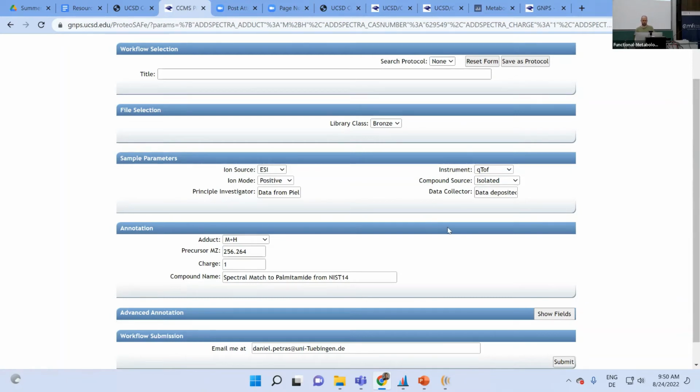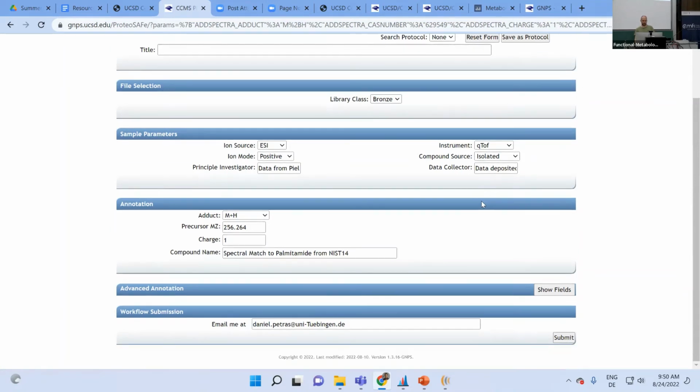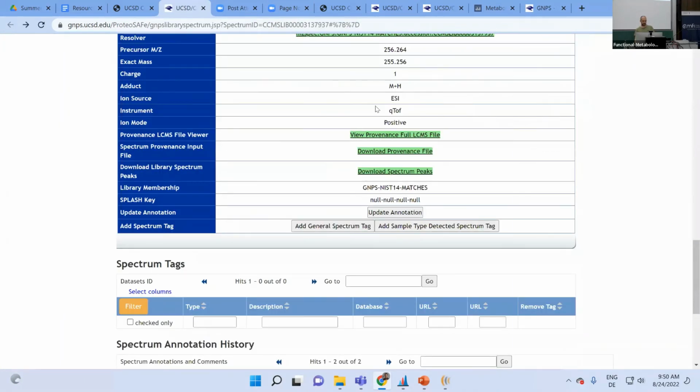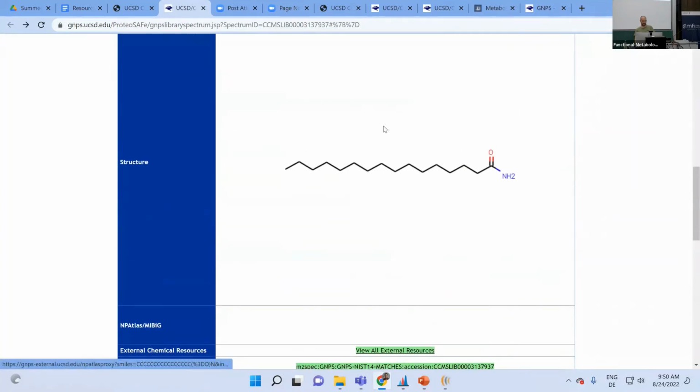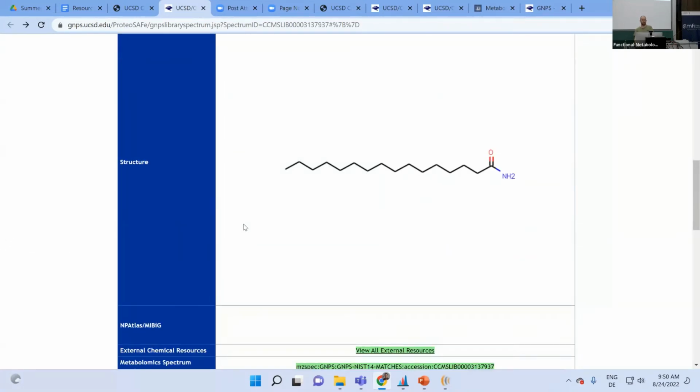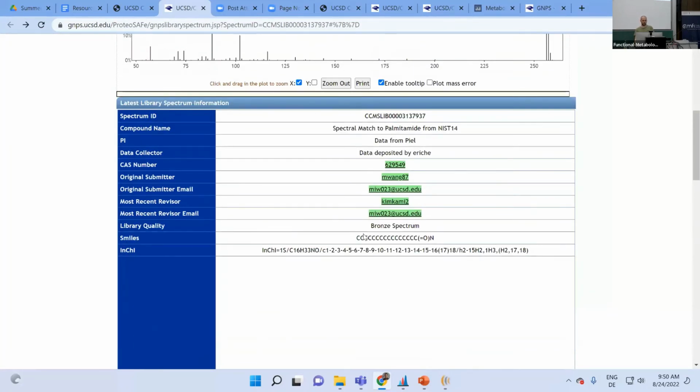Yeah. So there is a lot of information. Another thing that is very handy, and I think we don't have ChemDraw installed here, but I get SMILES code or InChI code right from here, right? So that's why a molecule is drawn here. And if I copy and paste this into ChemDraw, it directly draws me the structure.